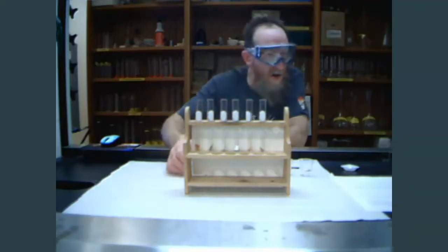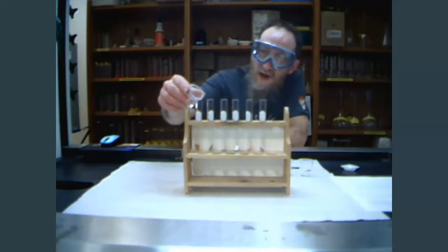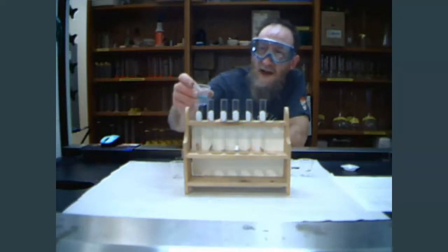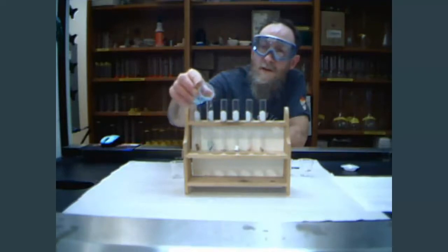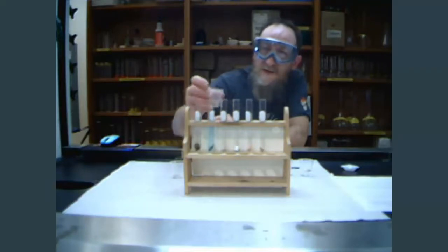In the first test tube here, I'm going to add some silver nitrate to my piece of copper. The second one, I have some copper nitrate. To the third test tube with the zinc, I have some lead nitrate.